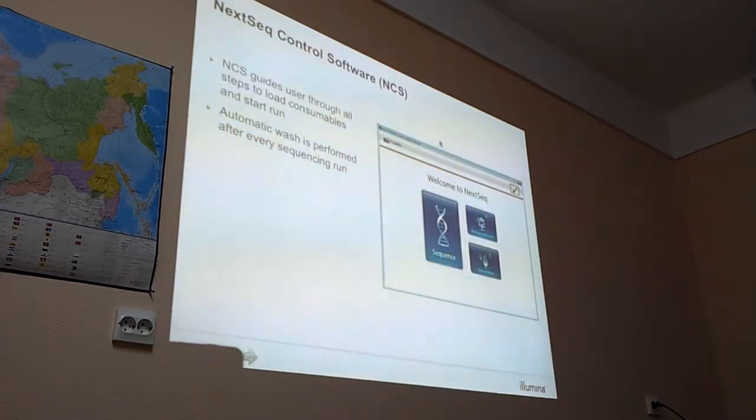And the software: MiSeq control software is MCS and NextSeq control software is NCS. So this is good to remember if you talk to tech support. Right, this is what it looks like. It has only three options, so it's a fairly clear structure: sequence, manage instrument, perform wash.